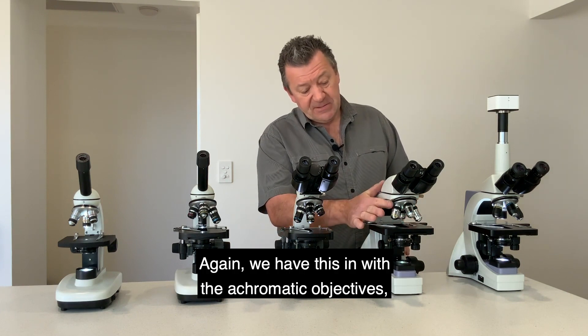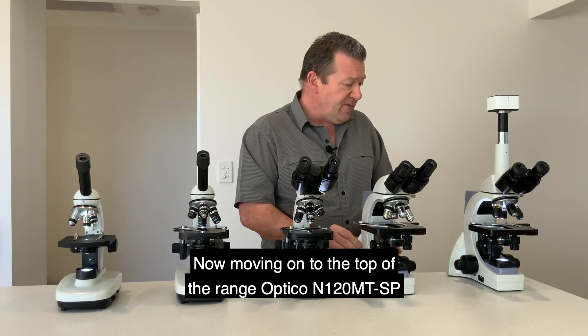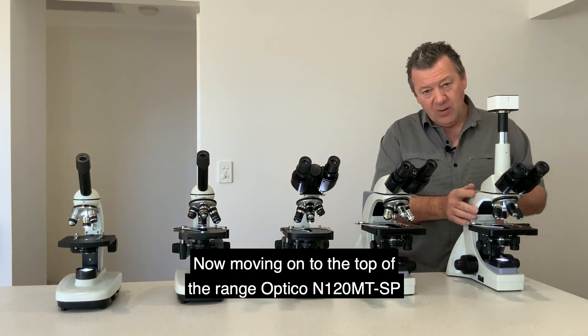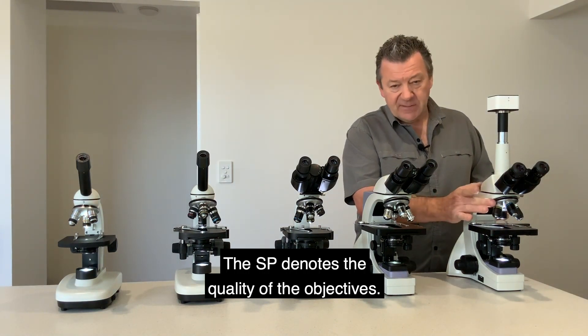Moving on to the top of the range, the Optico N120 MT SP — the SP denotes the quality of the objectives. These are semi-plan objective lenses, again in 4x, 10x, 40x, and 100x.